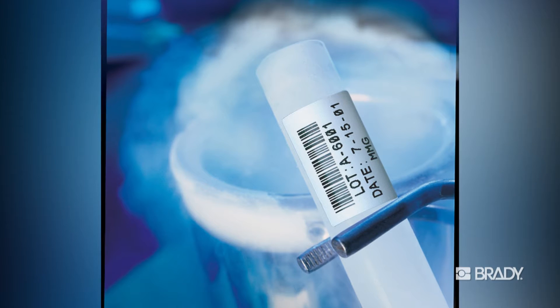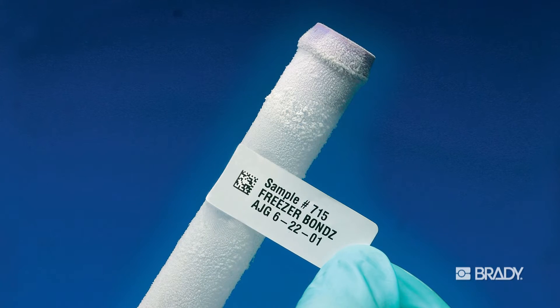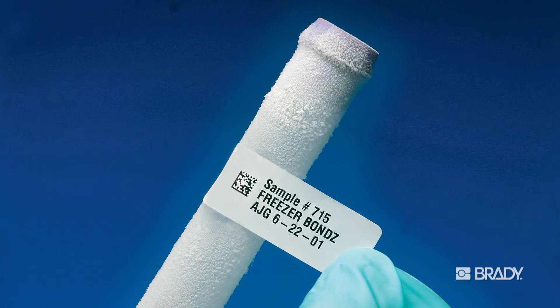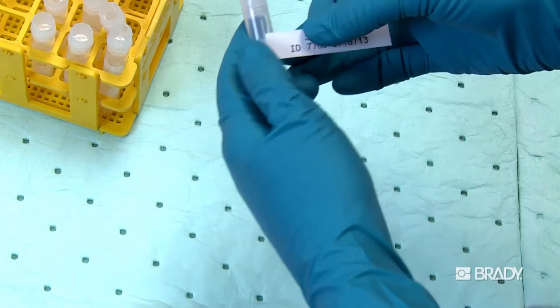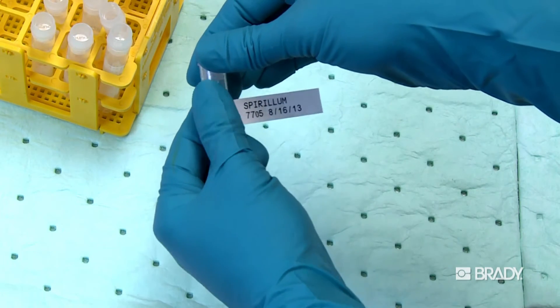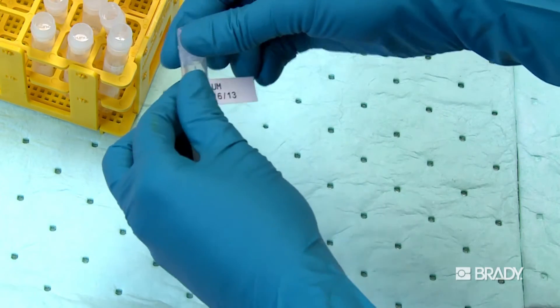The printed label has exceptional chemical resistance and can withstand exposure to extreme environments. To apply a label to either an unfrozen or frozen surface, take the lead edge of the label and place it on the tube. Slide your finger along the horizontal edge for a minimum of three seconds, applying firm pressure.